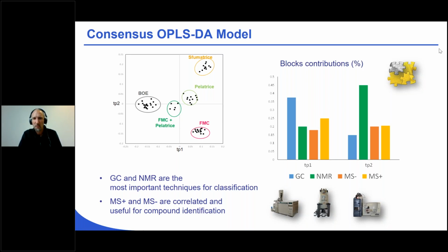But I think that this contribution with the polar compounds on the one hand and non-polar ones with NMR is quite interesting to show that we can really gain information by combining different analytical techniques to characterize the samples. But for the chemical composition, I'm not expert enough to discuss this in detail, if it's the question here.